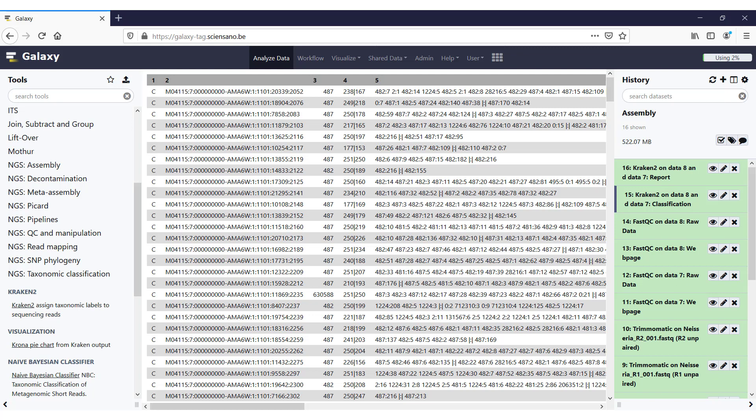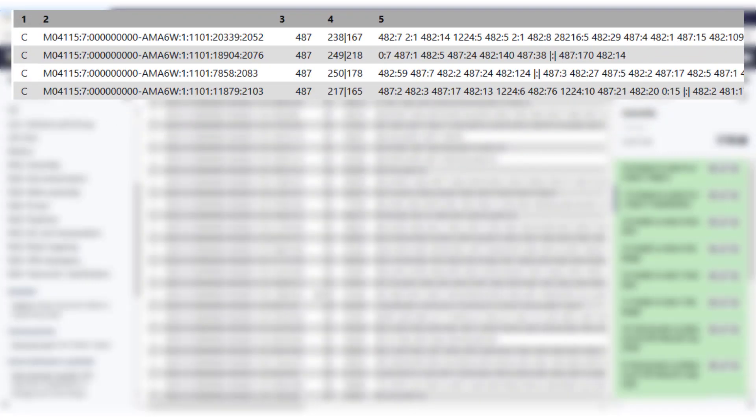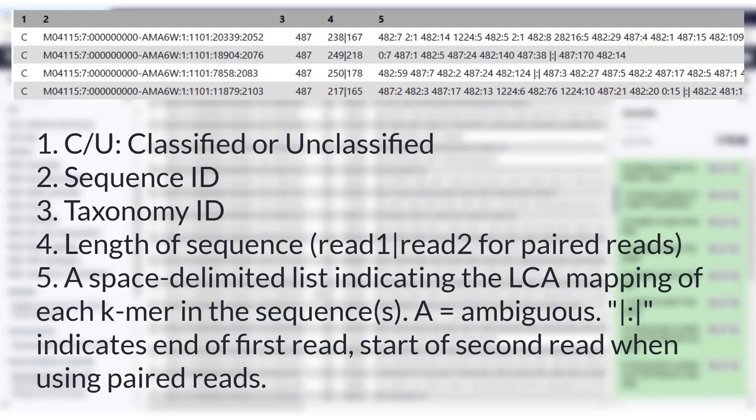So this is a list of all the reads, and each of them has a separate line in which a classification is shown. It has five columns. The first column says C or U, so it's either classified or unclassified. The second column shows a sequence ID. The third one is a taxonomy ID it was assigned to. The fourth one, in case of paired-end reads like this here, shows the length of a sequence, with a pipe in between to show the sequence length for the first read and the sequence length for the second read.